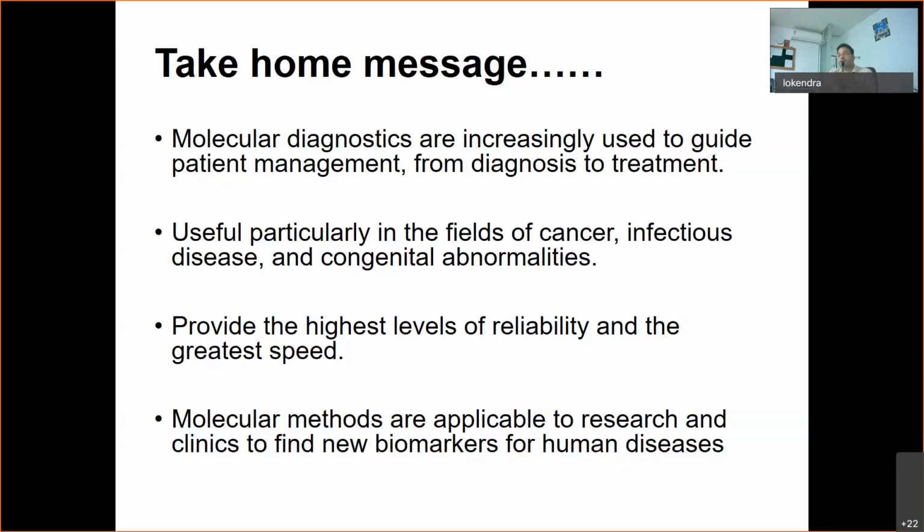It provides the highest level of reliability, because, again, in terms of COVID also, you find that everybody prefers RT-PCR tests nowadays rather than going to the TrueNat or maybe antigen antibody. So again, this is just one example of giving accurate, reliable, and robust results.